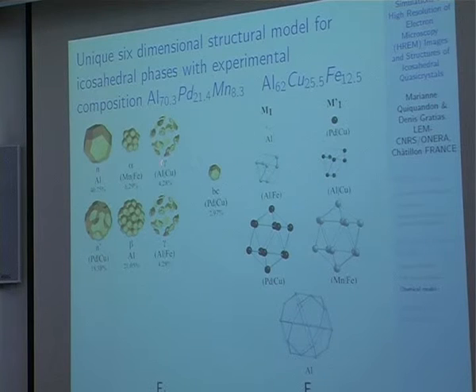And as an example, in the case of manganese, it occupies only the alpha cell, and entirely the alpha cell, with a volume of 8.29%, which corresponds to the 8.3 atom percent in the experimental composition. And this manganese distributes in physical space on this large icosahedron.